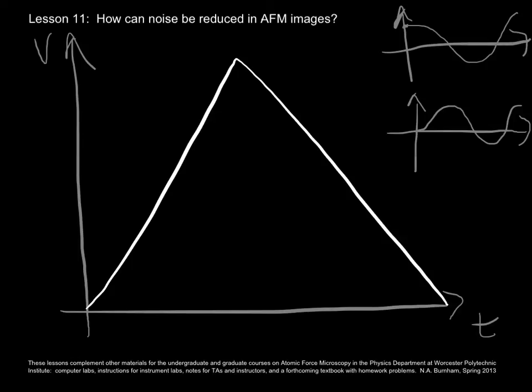And so our first attempt would be the same frequency as a triangle wave, looking something like that. That's a half cycle of a sine wave. But you see, the sine wave is fatter on the sides and not as tall as the triangle wave.